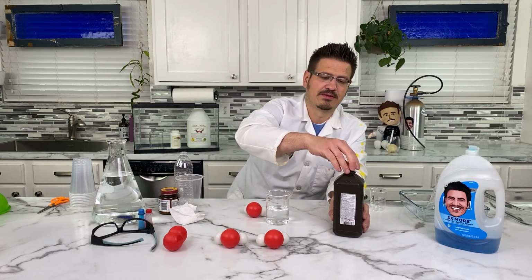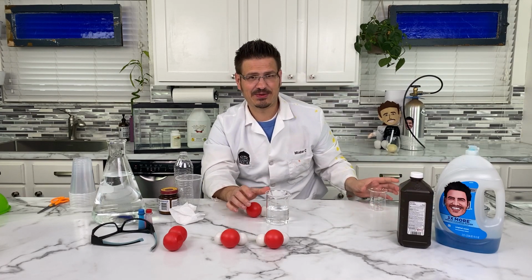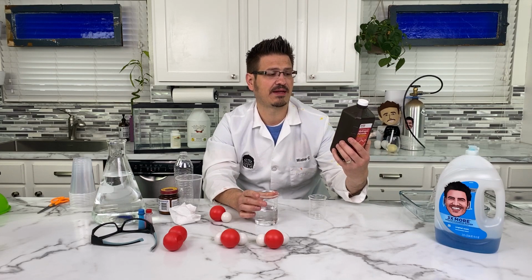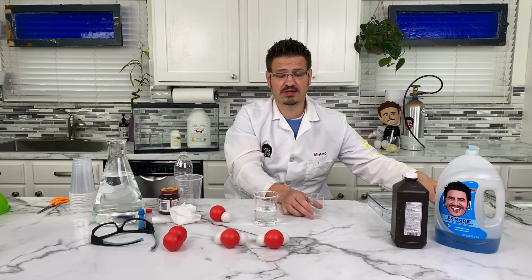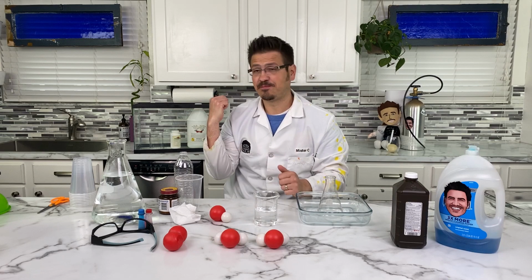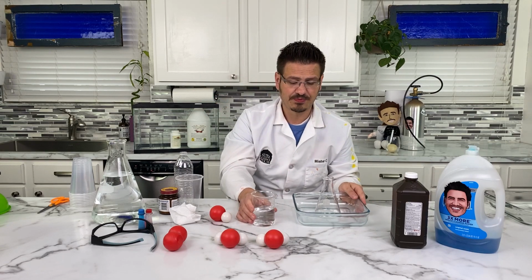All right. So what are we going to do? We're going to try to make some elephant toothpaste. How do we do it? You need some hydrogen peroxide. Now, this is 3% hydrogen peroxide. You can buy 6%, and then sometimes you can get higher concentrations of 9 and 12. And then behind me, I've got 35% hydrogen peroxide, and we're going to do something with that at the end.